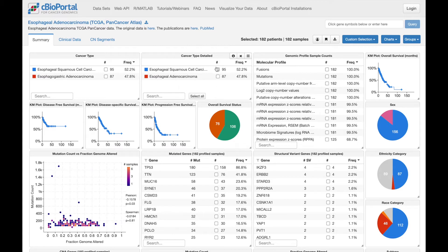Up here, we can see a table showing the breakdown of cancer types represented in this cohort, and here we see a table showing which molecular profiles are available and how many samples each profile has data for.